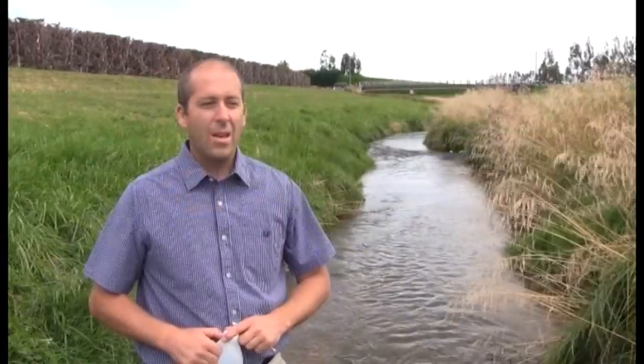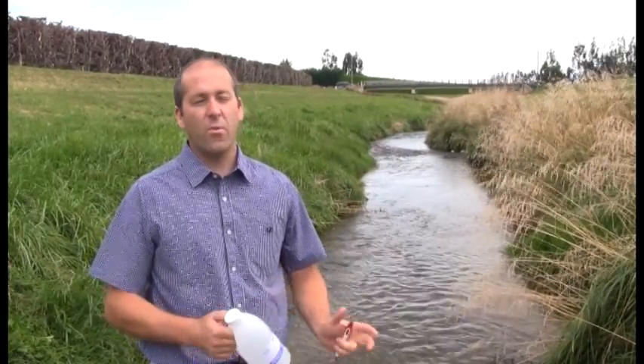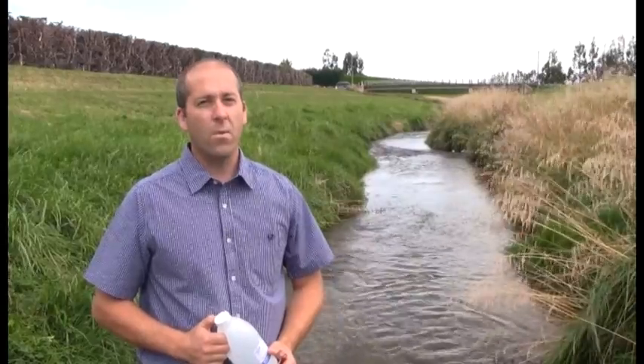Hi, my name is Craig Simpson and I'm a New Zealand Landcare Trust project coordinator working with the Pathway for the Pomahaka catchment project. We're here today to talk about basic water sampling for those of you who want to do their own water quality monitoring. Where the Otago rules state that you would take a water sample is at the discharge point from your property or farm.